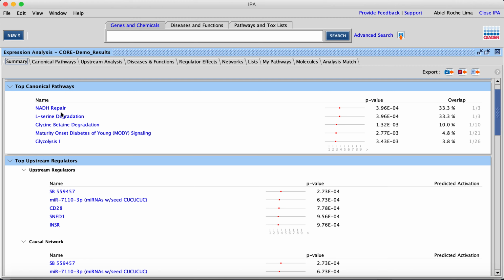In this case, we have so many proteins but so few in results, in terms of which of those proteins were considered significant. We were very conservative in that, even though we tried to be a little bit more flexible, and by selecting those cutoffs we are confirming that the 3 proteins we visualized using Lima are the ones that are significant in our filtering threshold using IPA.